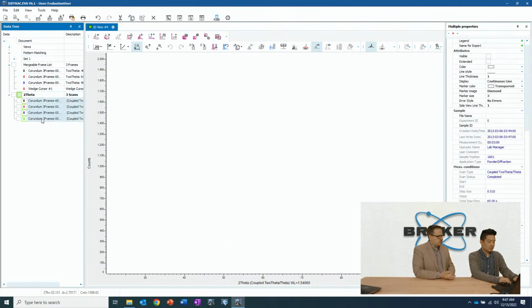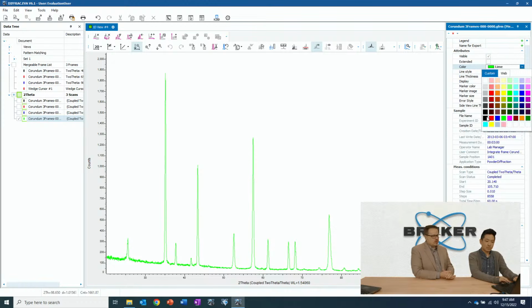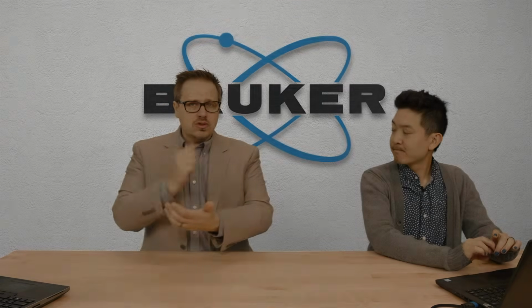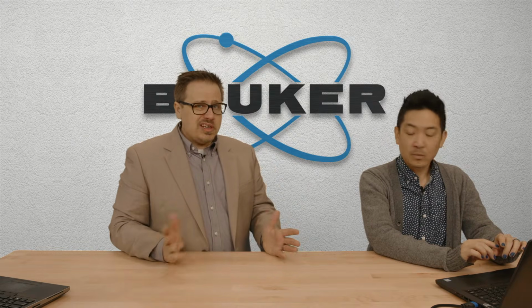And once you've integrated it, like Nate is showing here, you can stitch it all together, and now you can do the phase ID and everything else you want with it. If you have that 2D data, you don't need a different software to integrate it. It's all here. A lot of people like HTS, right? You do snapshot views in 2D, bring it in, integrate it all, throw it into cluster analysis immediately. You see in the well plate view, this is what's there. So your workflows really change depending on what you're doing, but that's the thing about EVA.